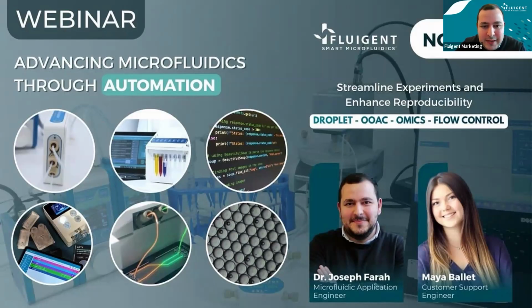In today's session, we will review the evolution of liquid handling technologies from the earliest manual methods to modern automated microfluidic platforms. We will discuss their limitations at the microscale and how pressure-based flow control and automation have transformed workflows from organ-on-chip to advanced biological applications.